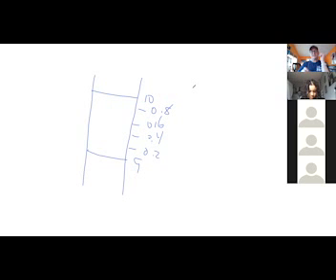So if you were to measure something that was here, you could be pretty sure that it's not 9, so it's more than 9, and it's less than 9.2. And if you were to look real close, would you say that this is more than halfway between or less than halfway between?